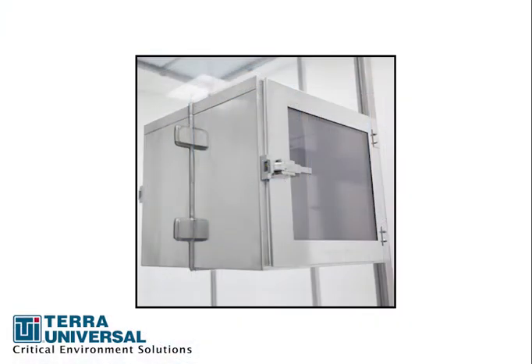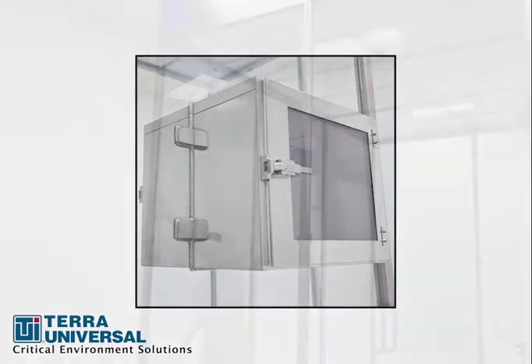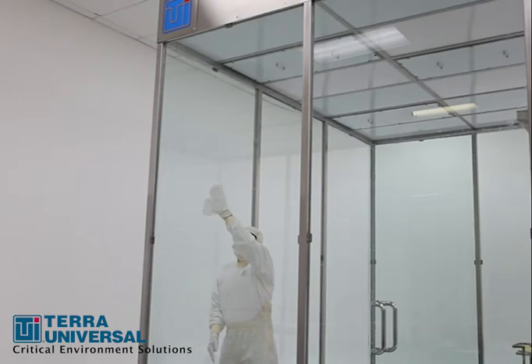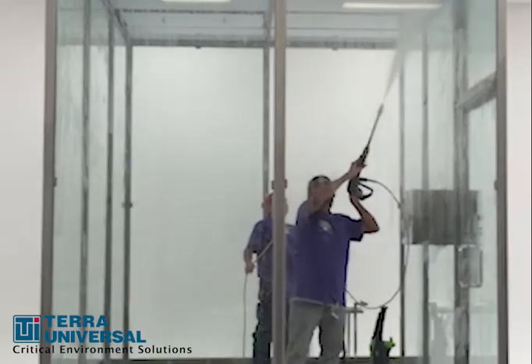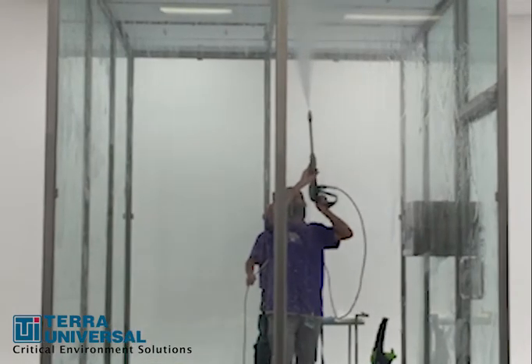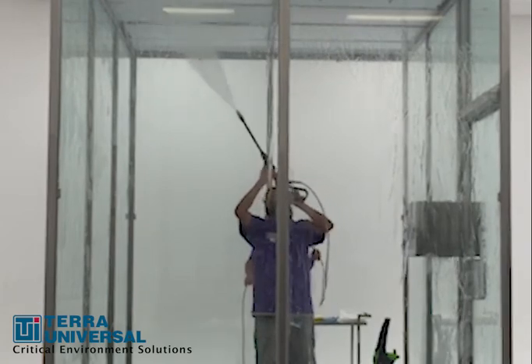Add a pass-through chamber for clean transfer of samples or supplies into the clean room. The BioSafe glass and stainless steel are easy to sterilize by wiping down with disinfectants. In fact, the tempered glass clean room can also be power washed with cleaning chemicals, followed by a sterile rinse of deionized water.